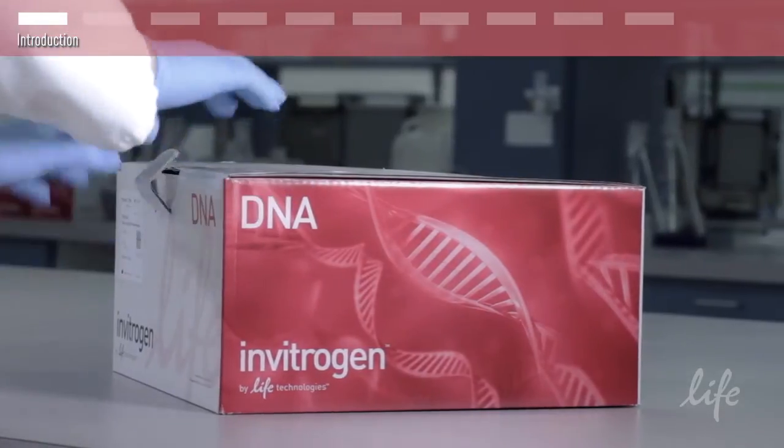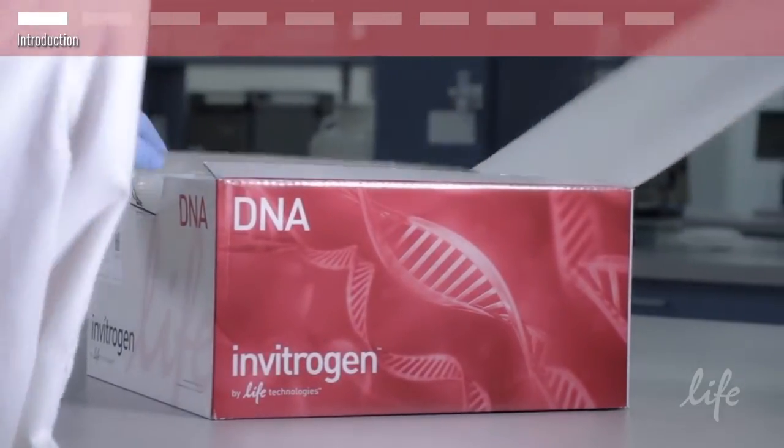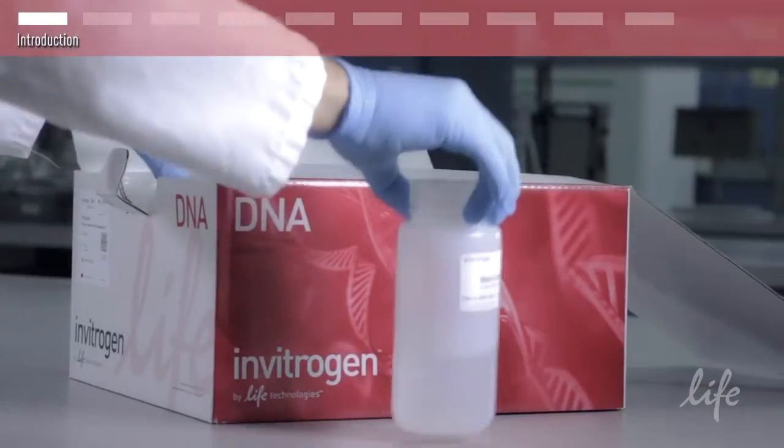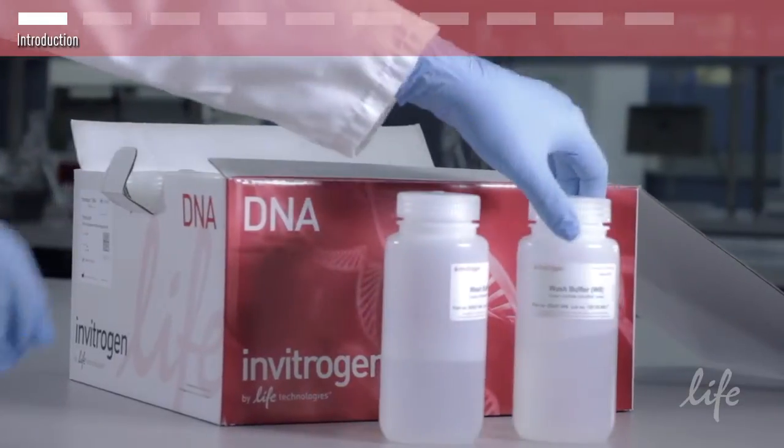When choosing your plasmid purification system, there are a number of things to consider: yield, purity, format, and ease of use.